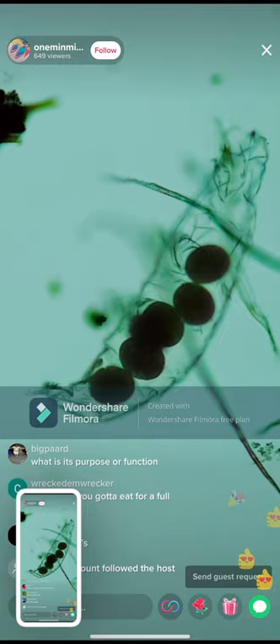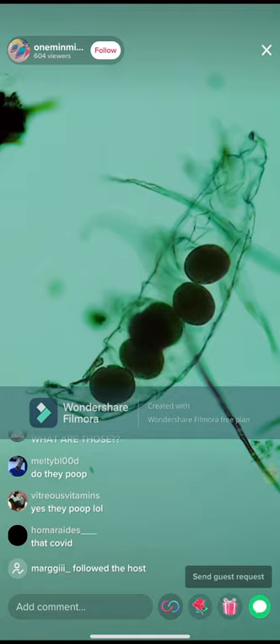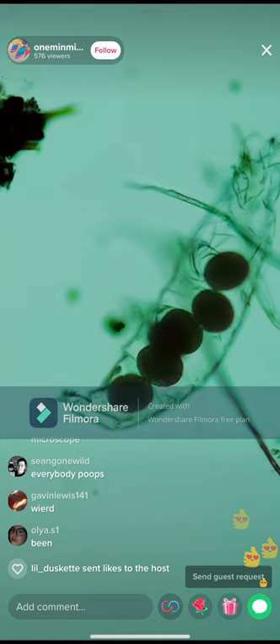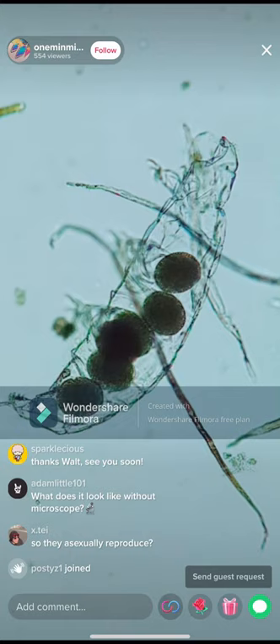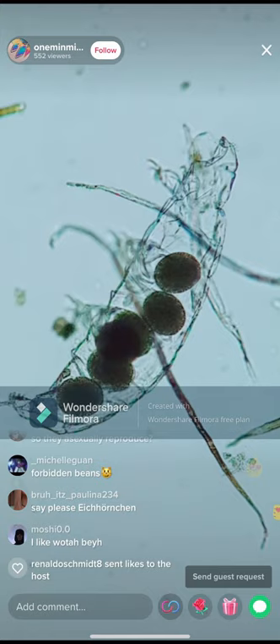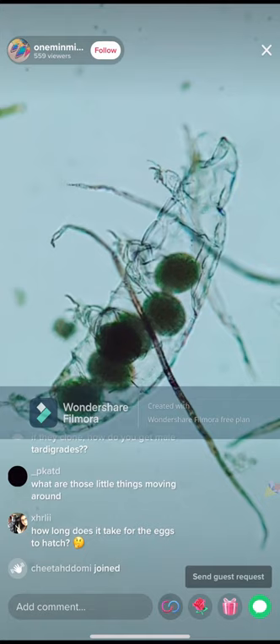Water bear — just to recap — is a microscopic animal, super cute. I get them from pond water, puddle water, or more commonly found in moss. The way they reproduce: the females can lay their own eggs, and they pretty much clone themselves. When the eggs are fully formed — a fully round, separate egg such as the ones you can see here — the tardigrade mother will shed her skin, known as a molt, and the eggs are laid inside the molt at the same time.